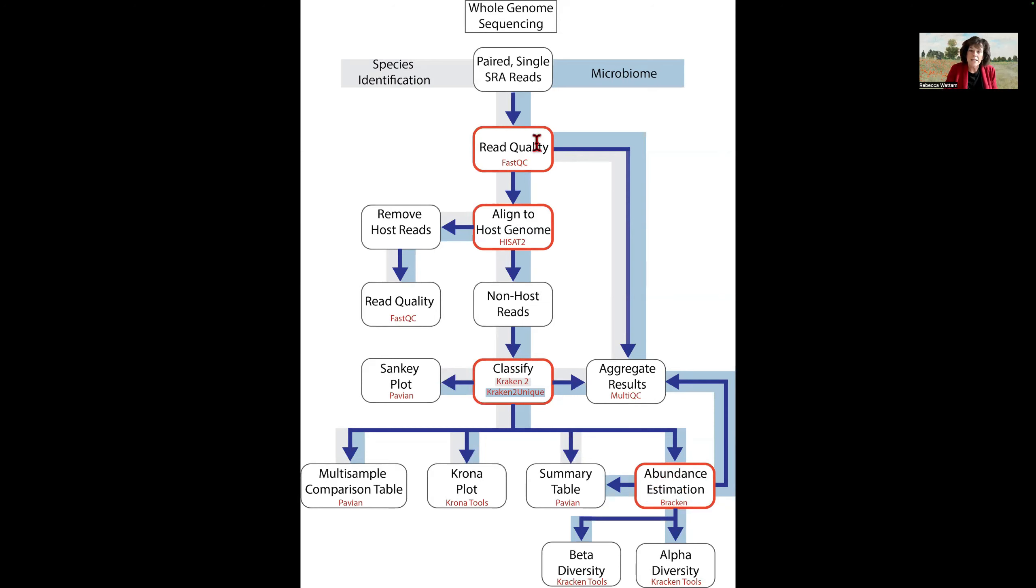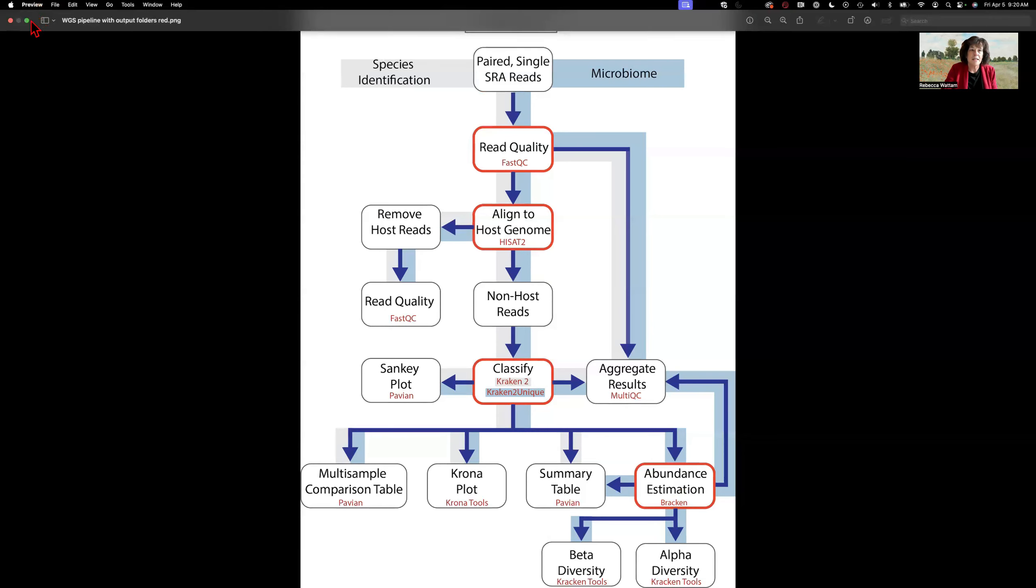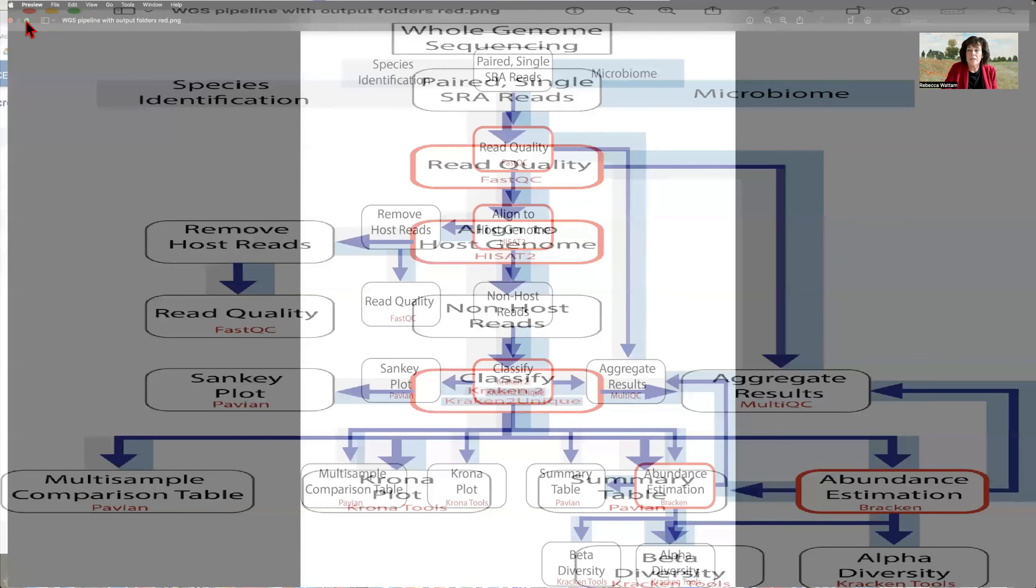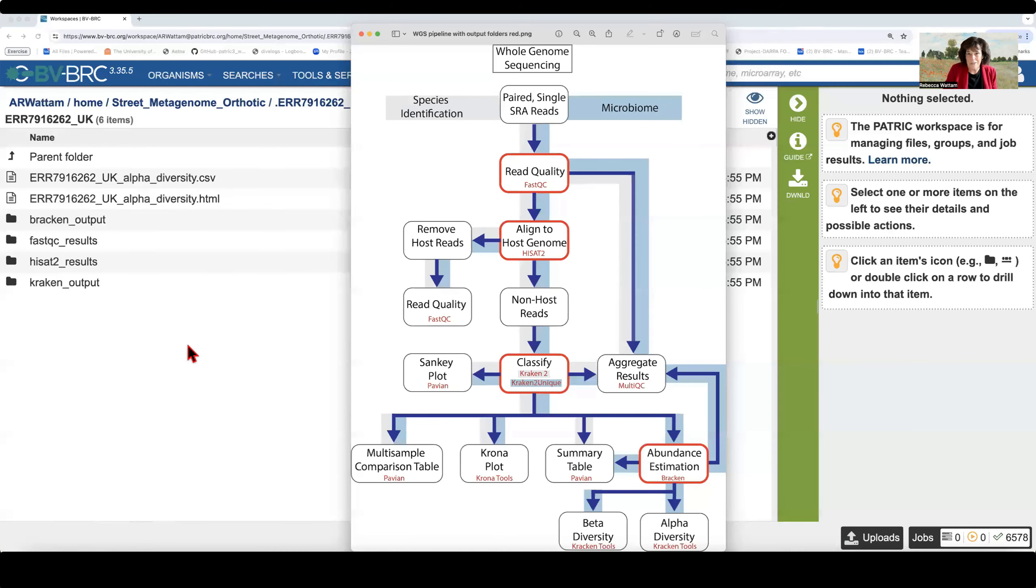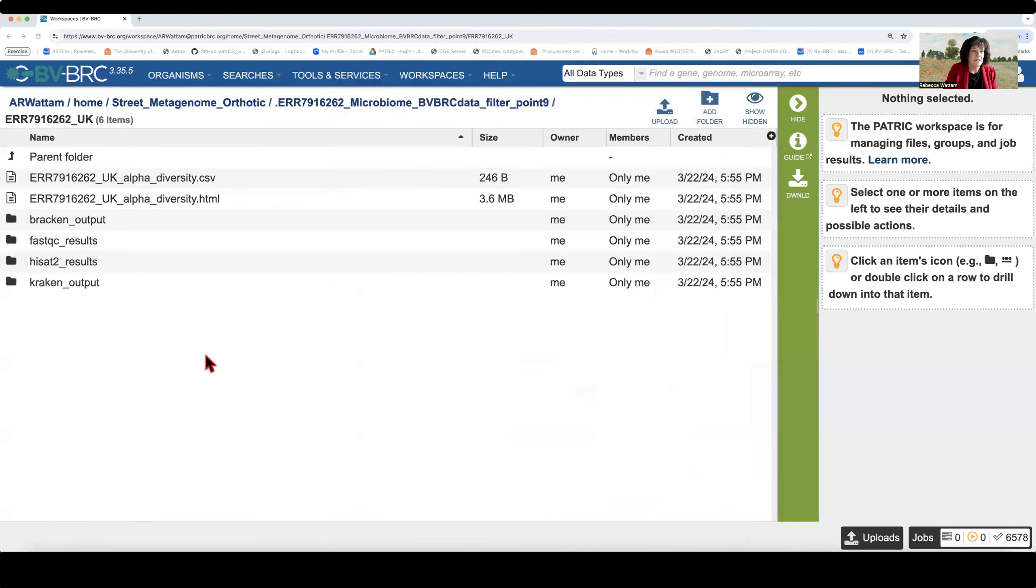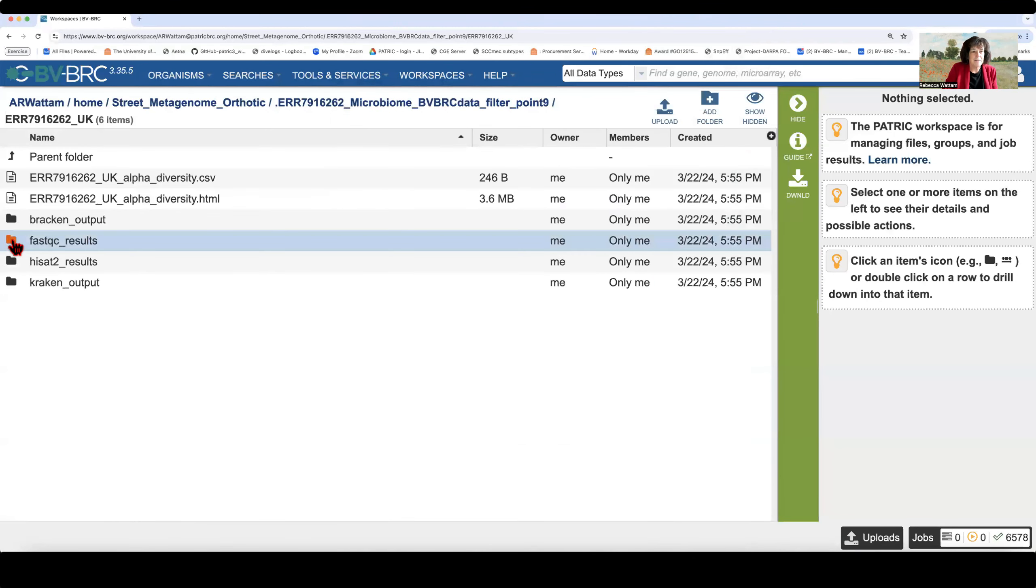So I suggest that we go over these in the order that they occur in the pipeline. And because I control the mouse here, we're going to do what I want. And we're going to start with FastQC, which is read quality. So I click on that.